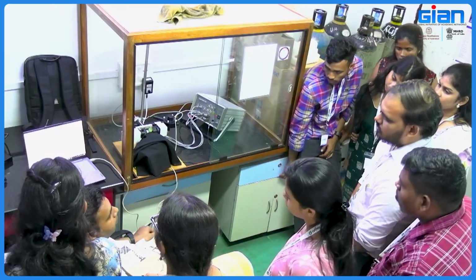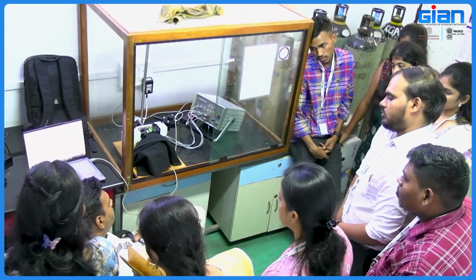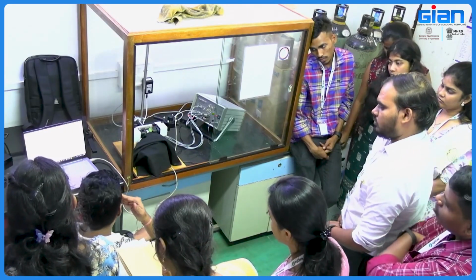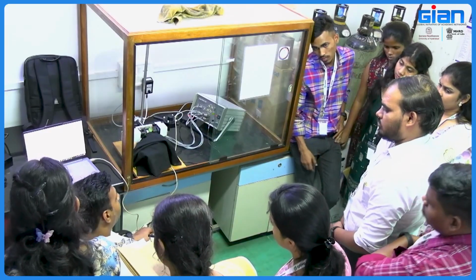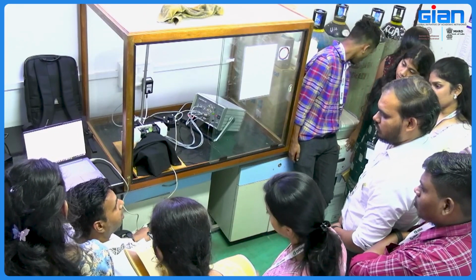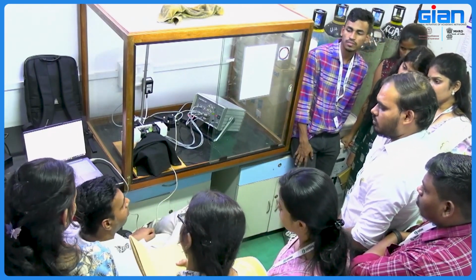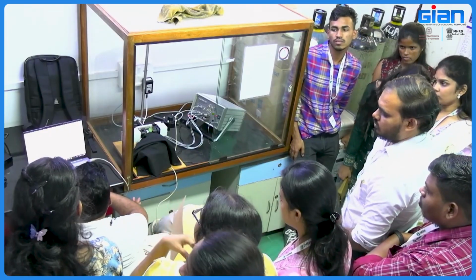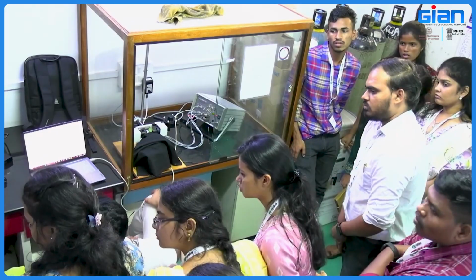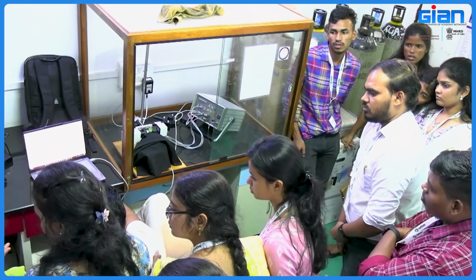Then comes your QN. QN is your coefficient of non-photochemical quenching. Okay, so there are different types of quenching. Maybe I'll talk about that later. Just for example, quenching can be of many types. At the last will be zeaxanthin dependent, QZ, and QI is inhibitory quenching. I'm not going into details, so just remember whatever you need to plot. Maybe you will show how to plot, and maybe at that time you can give more explanation, maybe in the hands-on.